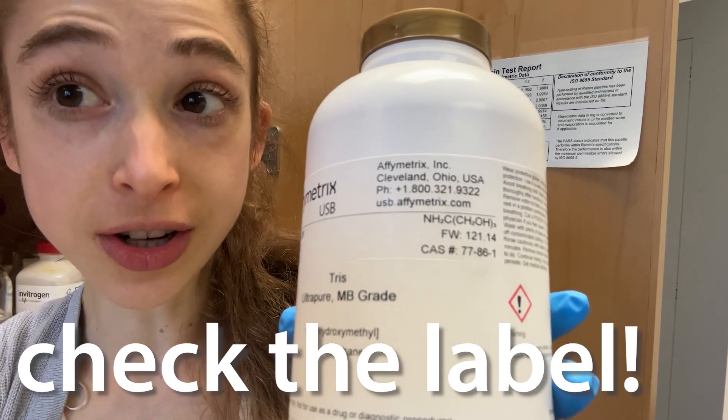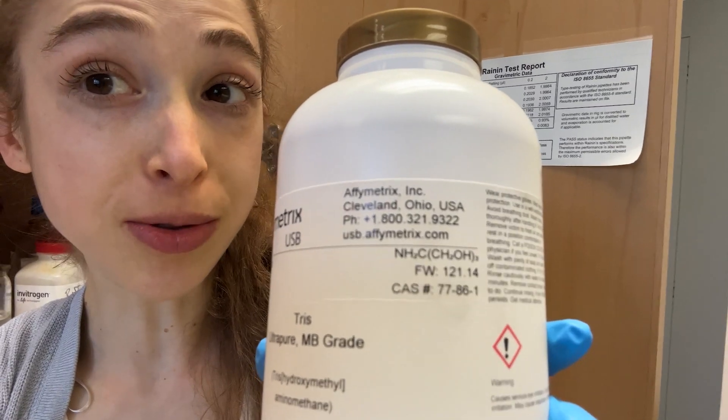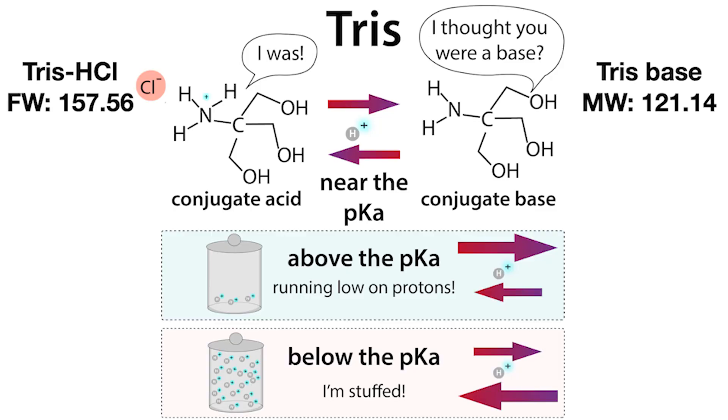It's really important that whenever you make a solution, you look at the label before you measure it out, make sure you're actually using what you think you're using, and look at the formula weight or the molecular weight. Here's a little bit more on why.